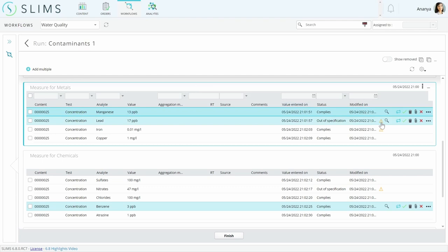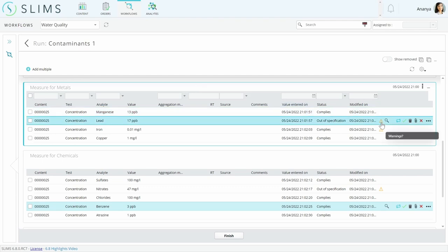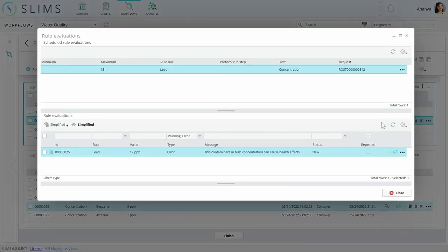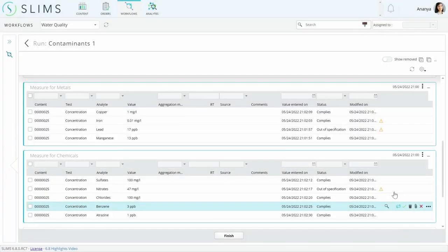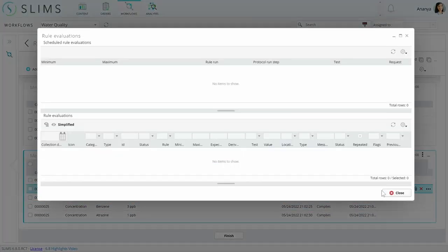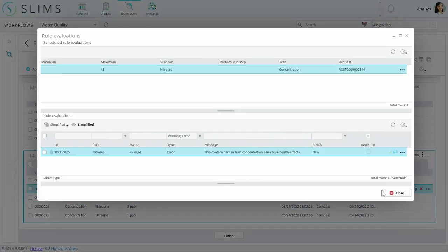There's some feedback on the results that were imported. On lead and on nitrates, the error indicates that these are risky contaminants in high concentration. The specifications for both analytes use the same specification type as the coliform specification we saw earlier.